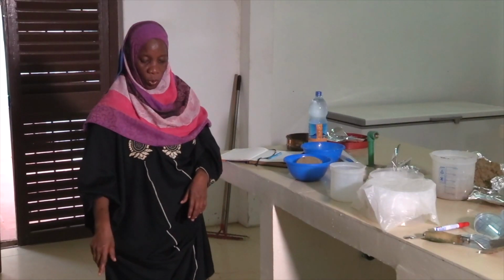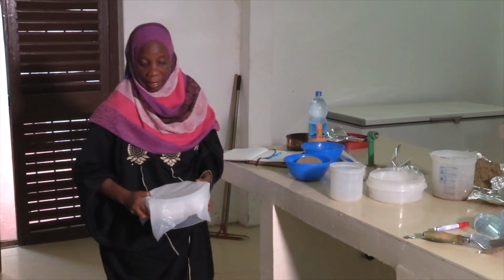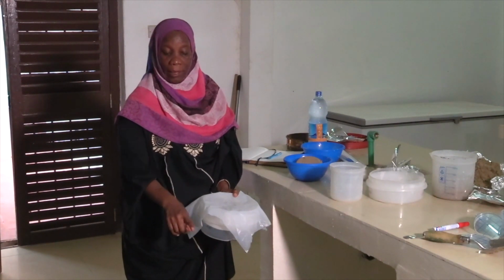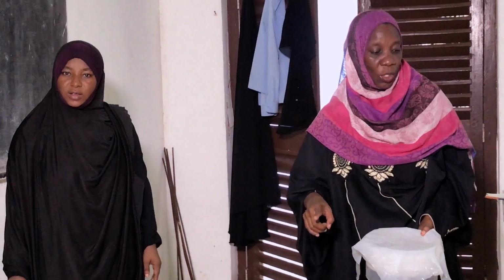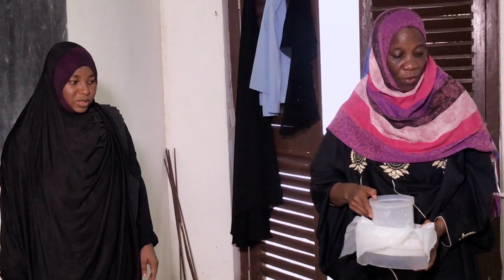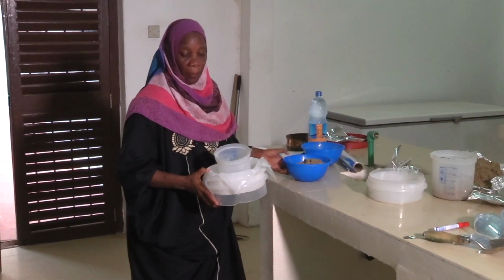Now we are going to make our mass density separation, but before that, we should sieve our solution, because maybe there are some unwanted particles. First of all, we need only 4 liters for separation of the 1 kg sample or replicate.